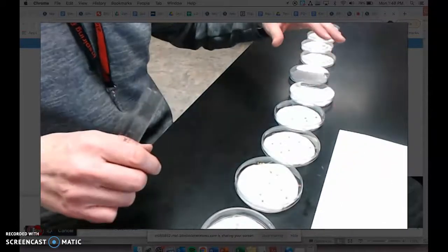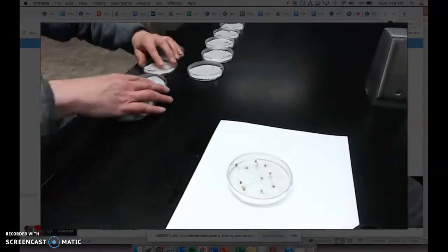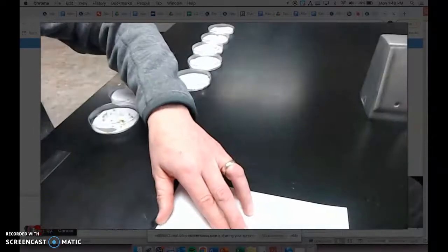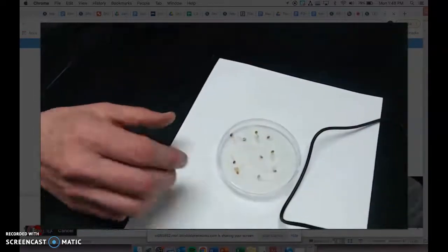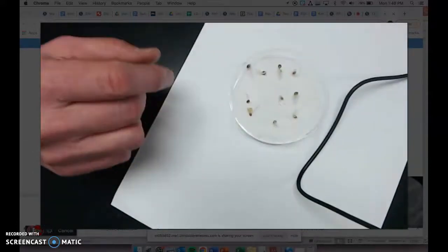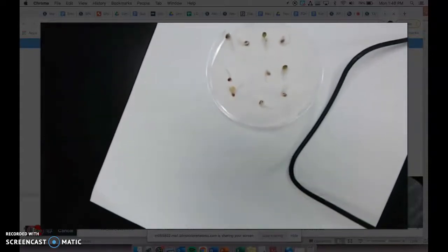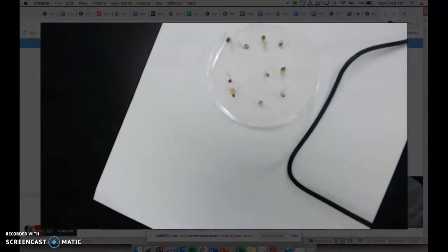But which one? I think we're going to choose this one. 1% solution. That's the 0.1%. Oh, 0.1%. And so we're going to look at this. I'm going to let you adjust. And you can see that all the 0.1 seeds have germinated.